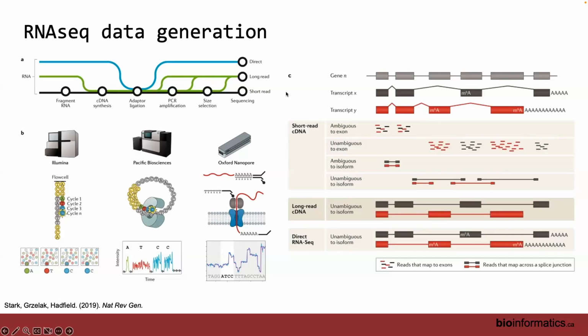Okay, so what is a read, informatically speaking? What does raw data look like for RNA-seq? So if you got a read for RNA-seq, it just came off the sequencer, right? People say this, it came off the sequencer. So what do you get? That's right. It'll be a bunch of strings. That's the term for it. It's like strings.